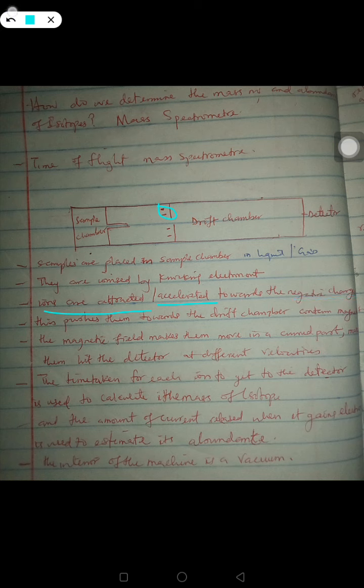They bend. I was mentioning to you that this region has what we call a magnetic field. The drift chamber is contained in a magnetic field. The detector typically is not really at the center but somewhere by the side. It's easy to put it at the center so that you can understand the basic working principle.